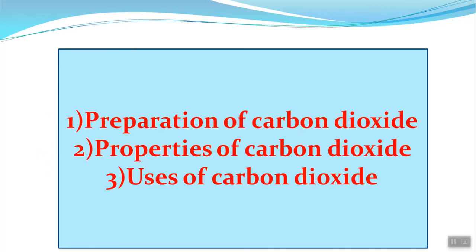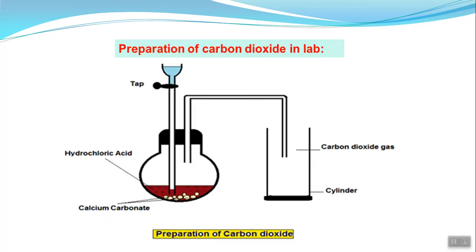Today we are going to continue lesson 2, which is carbon dioxide. Today we will study how to prepare carbon dioxide in the lab, the properties of carbon dioxide, and also the uses. Number 1, we are going to know today how to prepare carbon dioxide in the lab.